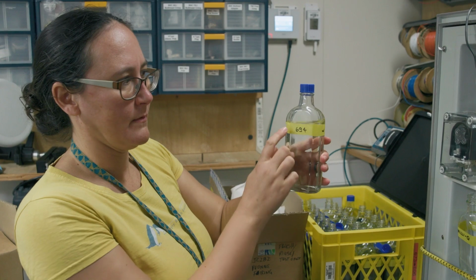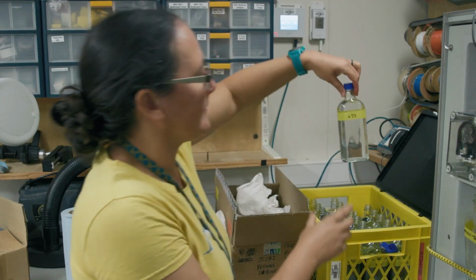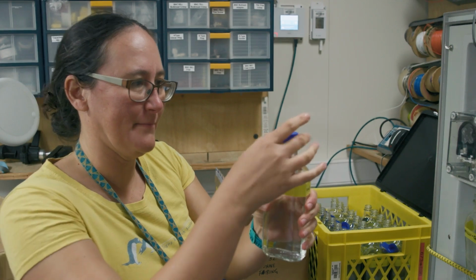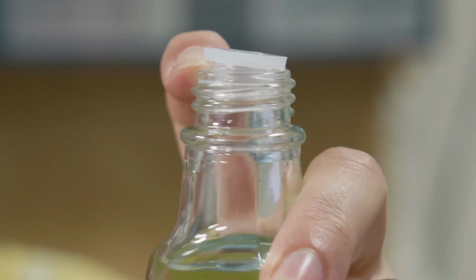It's important to check the sample bottles as you go. For example, this one has not been filled enough and has probably had evaporation into the large airspace at the top of the bottle. This one has been filled correctly, leaving a small airspace, but when we remove the screw lid and examine the plastic insert, you can see it has not been properly pushed down to the bottle lip all the way around.